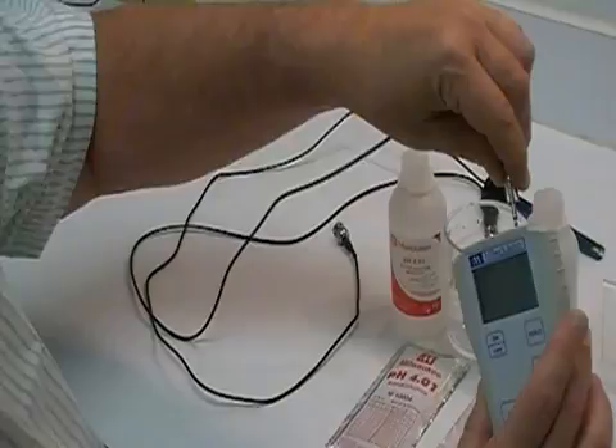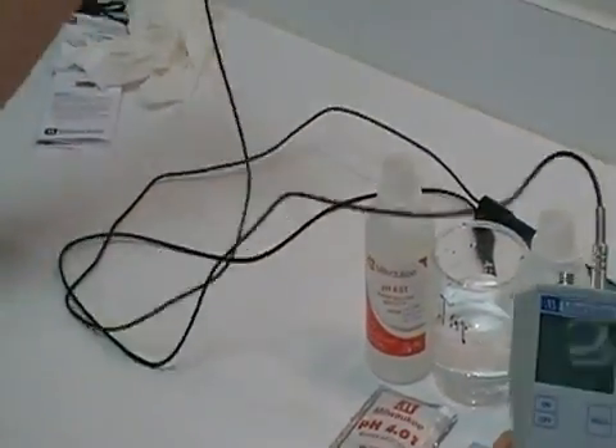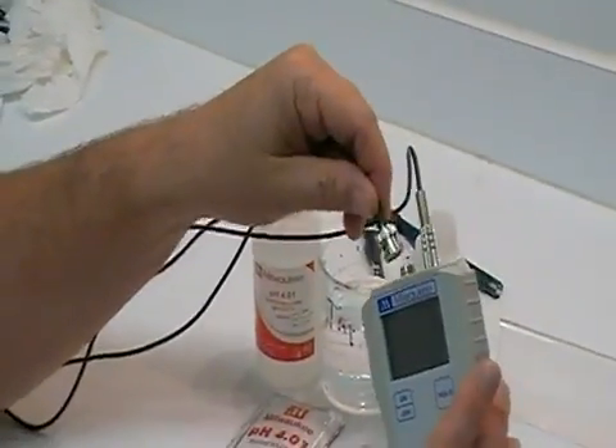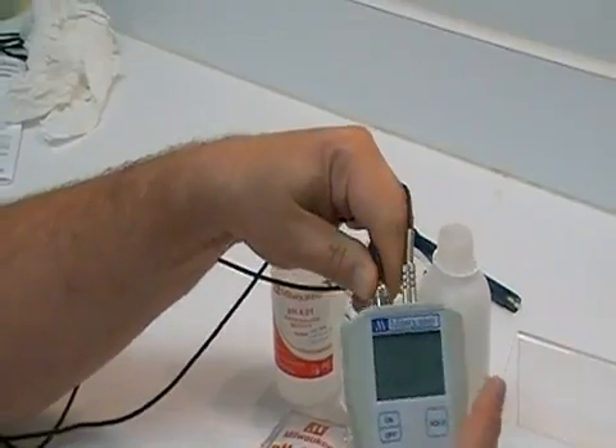You also have a temperature probe, which you need to have always hooked up anytime that you're using your unit. And you also have a BNC connector pH probe, which turns, locks, and twists.